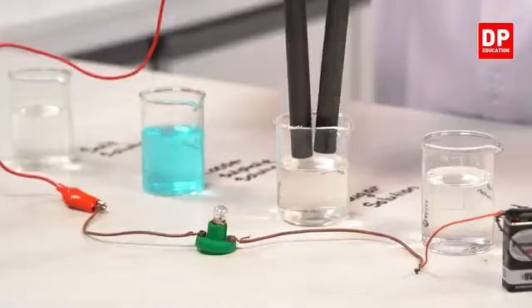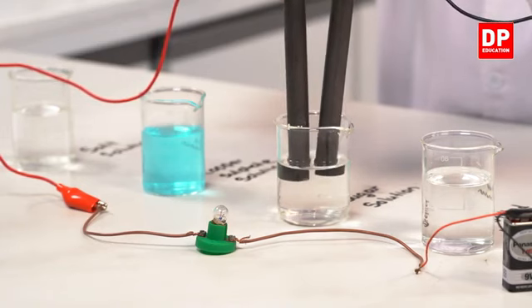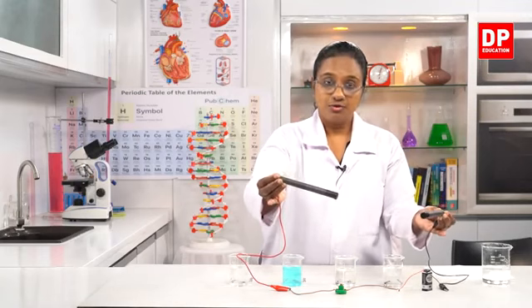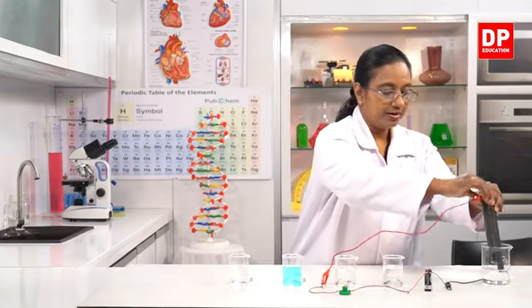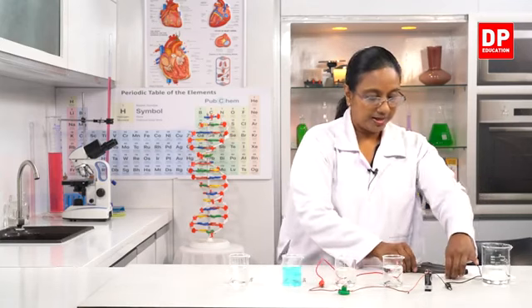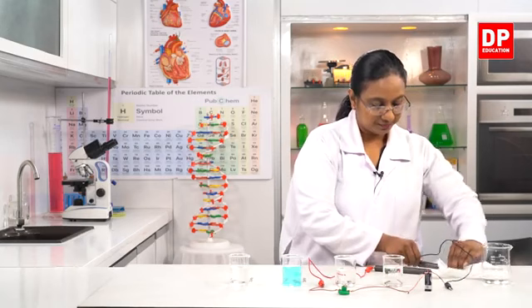So this is the second one. Now also you all can observe and see the bulb does not light. So the first 2 solutions, distilled water and sugar solution, the bulb did not light. Here I have distilled water to wash the electrodes, and I have to make sure they become dry before inserting into the next solution.